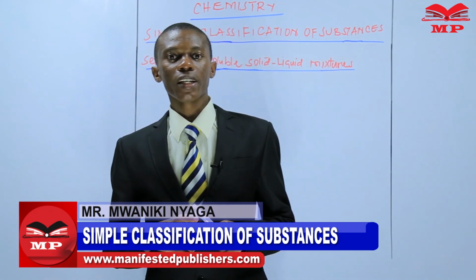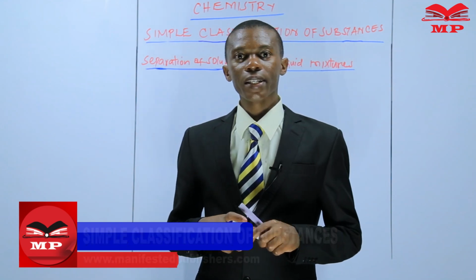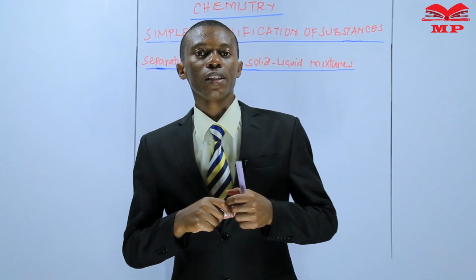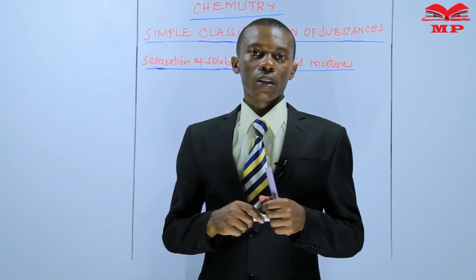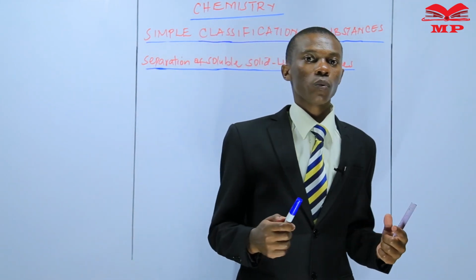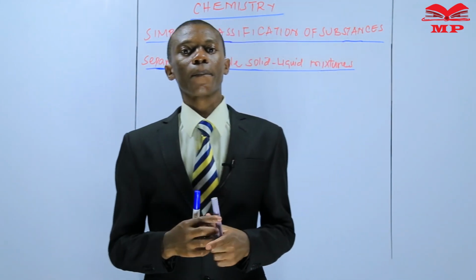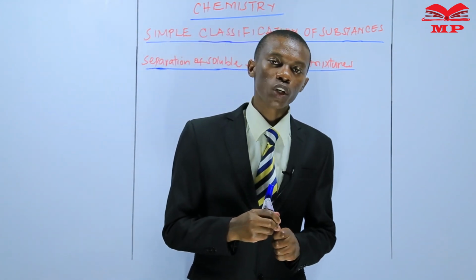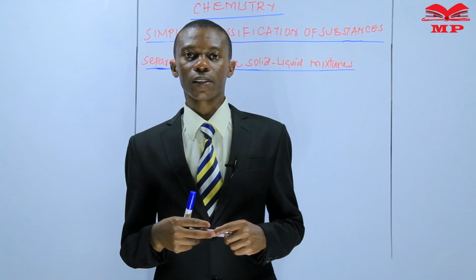We are learning chemistry from 1 and the topic is simple classification of substances. In our today's lesson, we are discussing separation of soluble, solid, liquid mixtures.